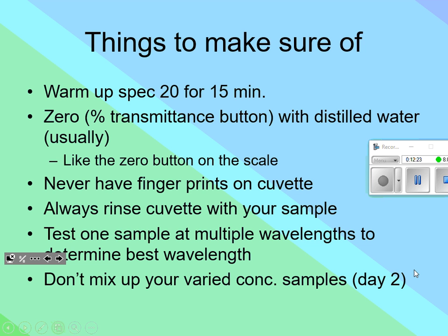So you usually pour a little bit in. I have pipettes, you can squirt some in, you roll it around, you dump it out, and then you fill it back up. A lot of things that we do at times in class in the lab seem like it's wasteful. Oh, we're throwing away weighing boats. Oh, we're throwing away pipettes. Oh, we're rinsing out a solution and we're just dumping that solution out right away. We do it so we can get good data. If we don't do it, we get poor data. And just like I've been trying to harp on Chem 1 students, poor data leads to poor results, leads to poor conclusions.